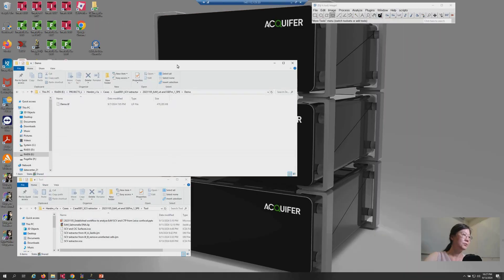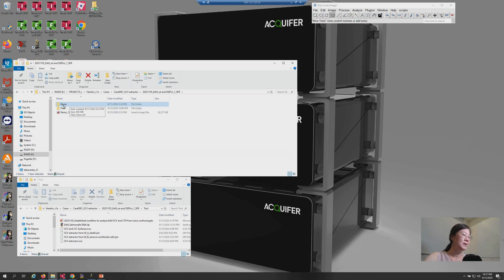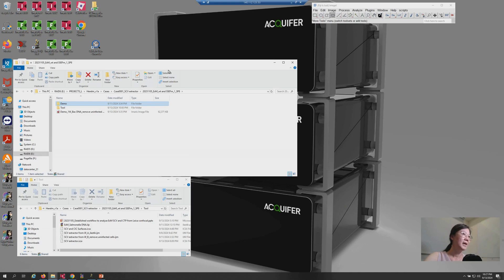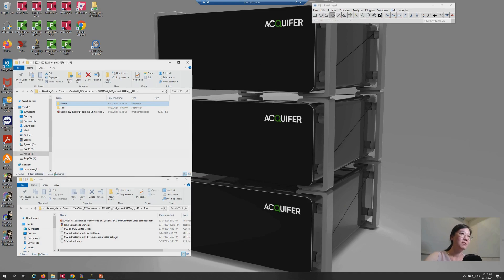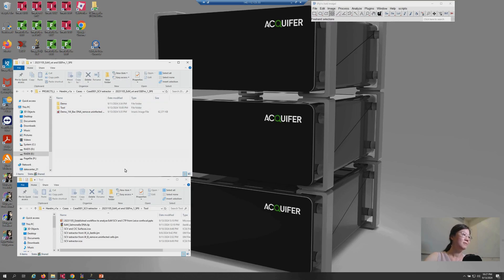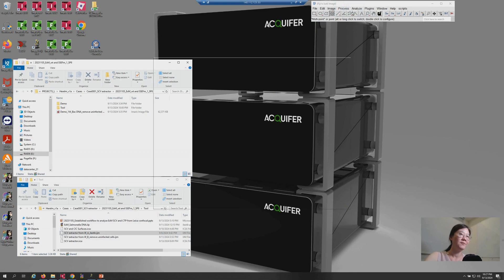For the tools, please generate another folder in order to collect the dataset you want to process. So, here I just call it demo. And then, please launch your Fiji and just drag and drop the script A on Fiji.